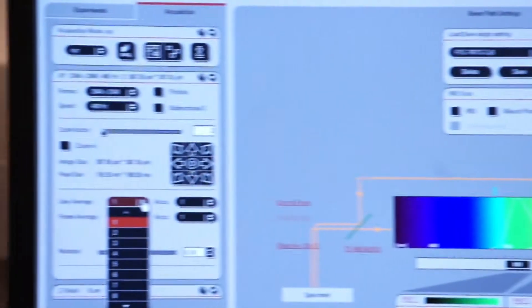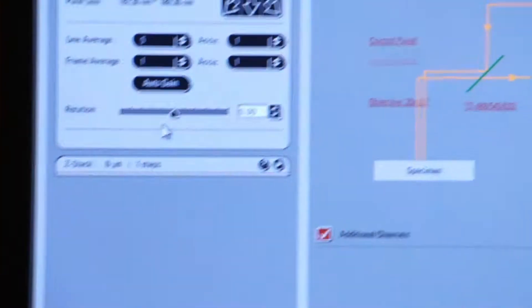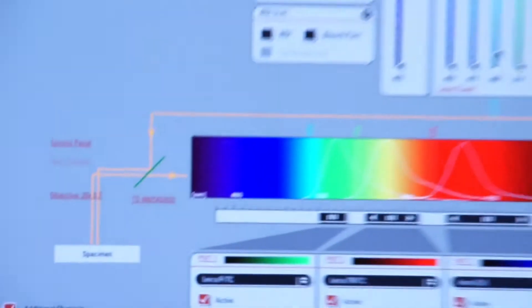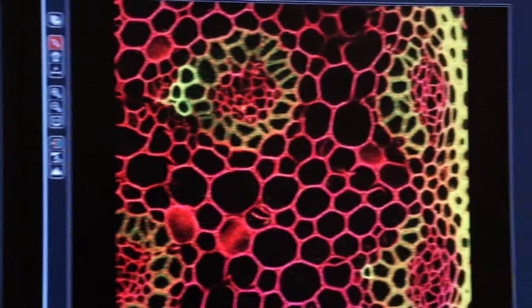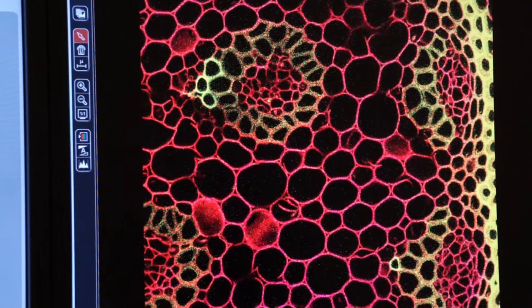So let's go back and engage line averaging. Let's select 5 scans per line. We'll click on capture image again. Watch the right screen and you'll see our new image come up.